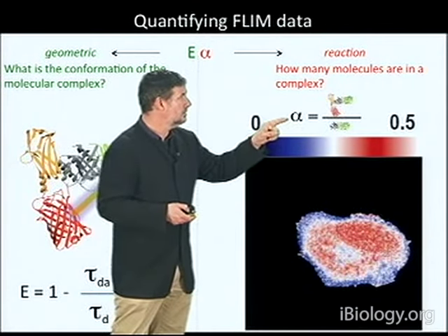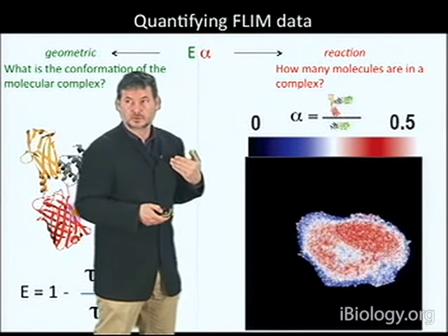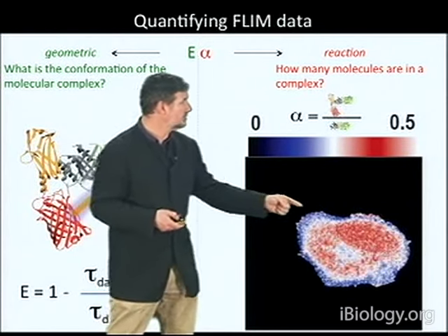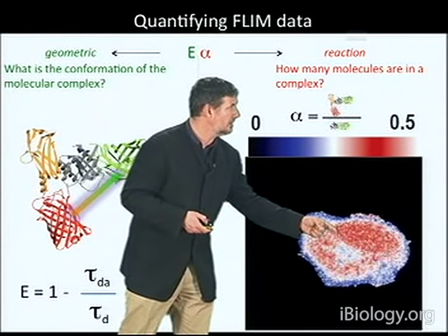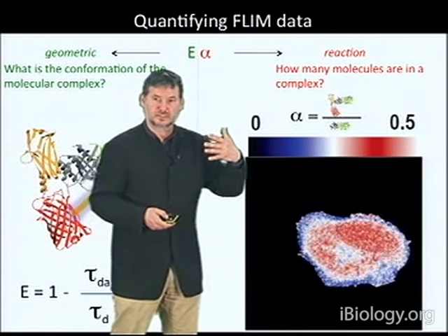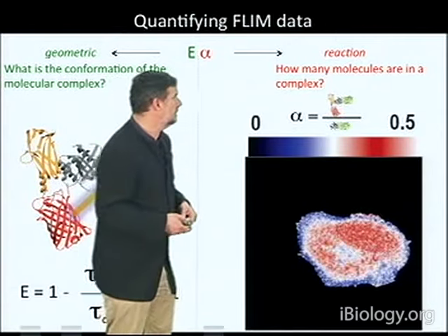So here we get then the fraction, in a false color table, a fraction of molecules that are interacting, in this case RAS interacting with PDE-delta. You can see, for example, here that at the plasma membrane we do not find interaction, and at the Golgi we do not find interaction, whereas we clearly see interaction in the cytoplasm. And this was highly relevant to couple, let's say, the state of RAS to its interaction with PDE-delta.